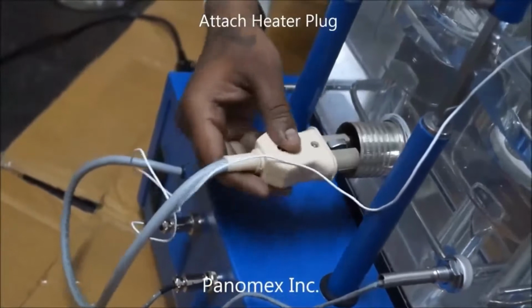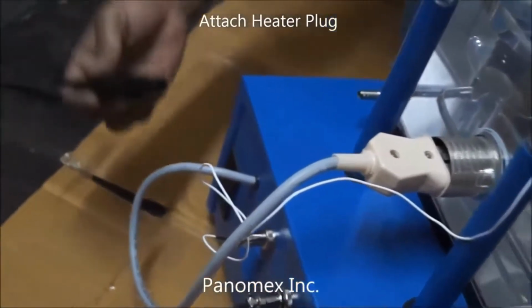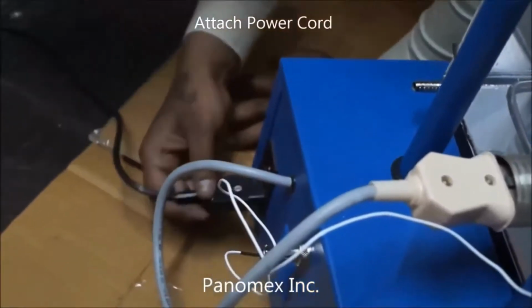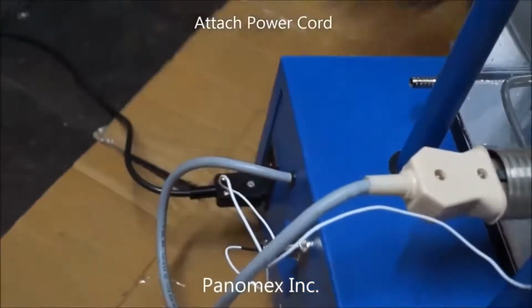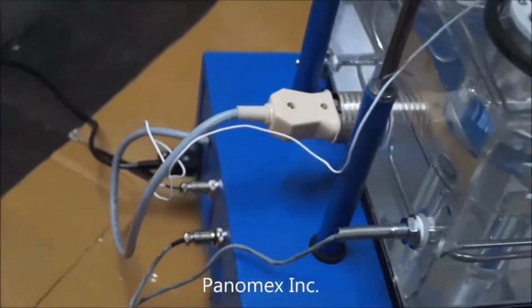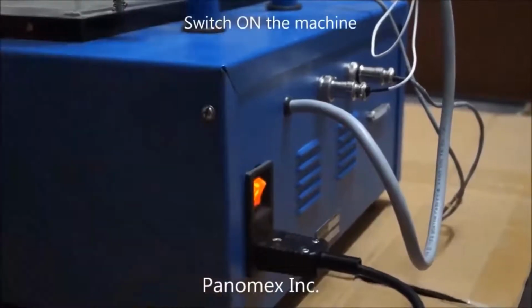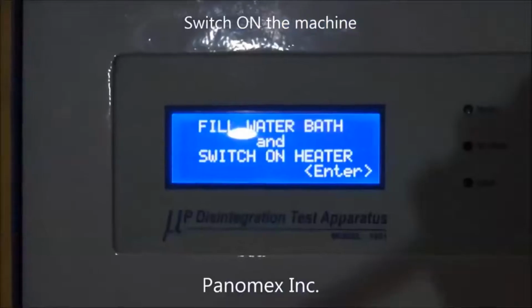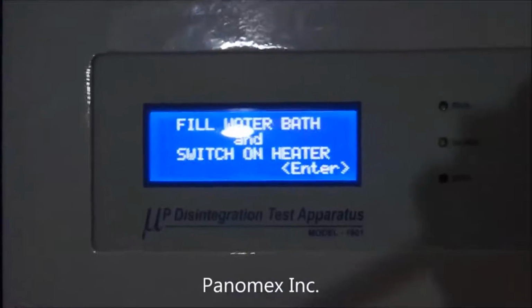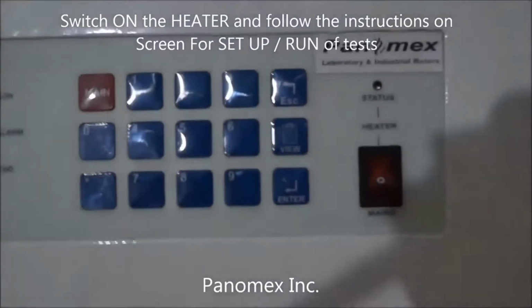This is the water heater plug. We need to attach the heater plug to heat the water and fix the temperature at 37 degrees Celsius, or whatever is required as per the STP. Now we have to switch on the machine and enter the temperature that is required. Follow the instructions.